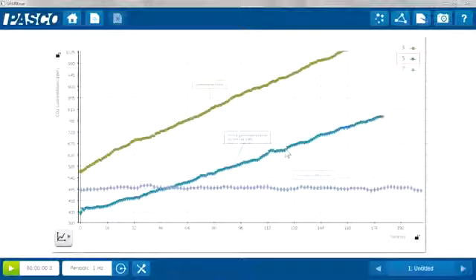You can then send the students into further exploration, looking at the effect of temperature on cellular respiration. So the other run of data that I have here, you can compare the green to the blue here, and that's a comparison of germinating seeds at room temperature to germinating seeds that were soaked in an ice bath.